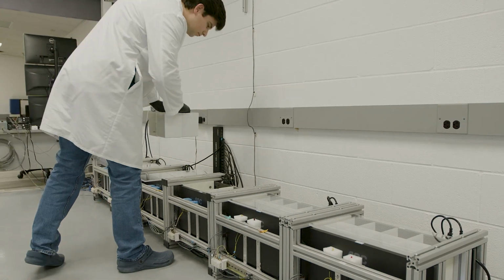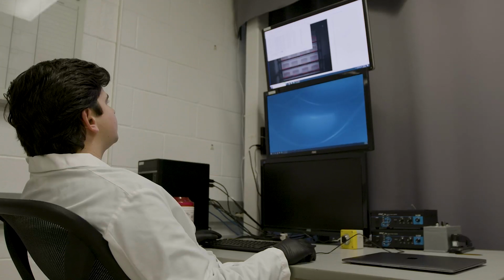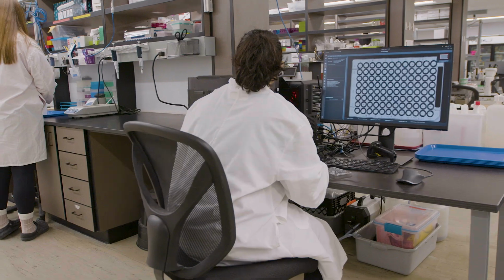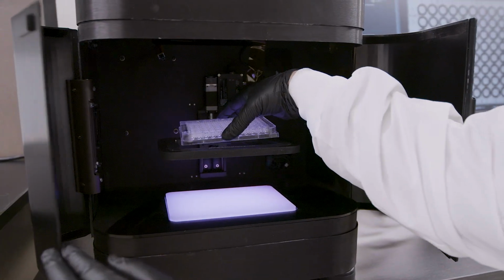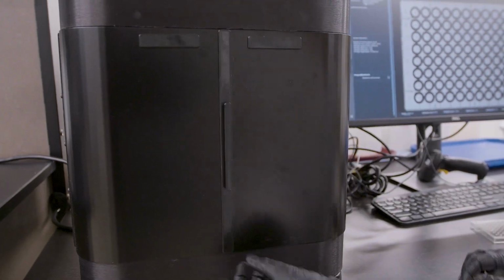So I think the students and postdocs who leave this lab leave as well-rounded scientists, leave with an understanding of the impacts of our work. Dr. Tanguay, as a mentor, encourages us to think about the impacts of our research, think about how we personally and as a team can advance the field of predictive toxicology. I think the zebrafish model and the data generated from it will play an increasingly important role in 21st and 22nd century toxicology.